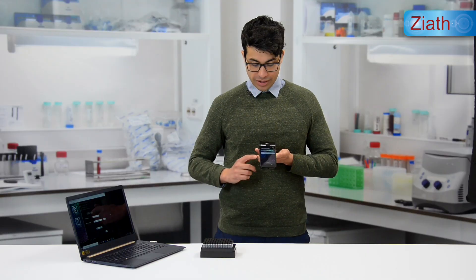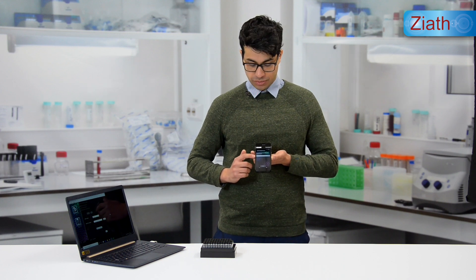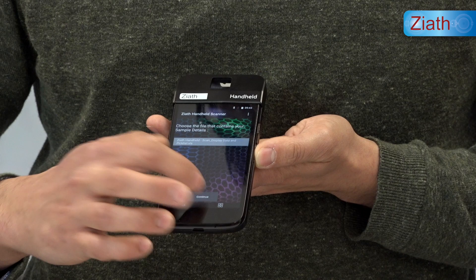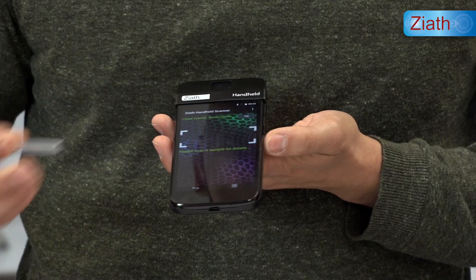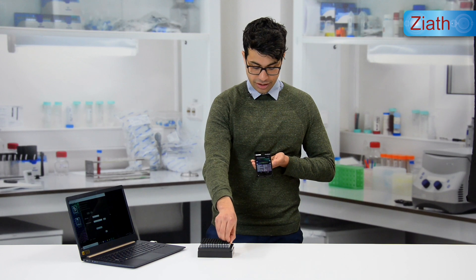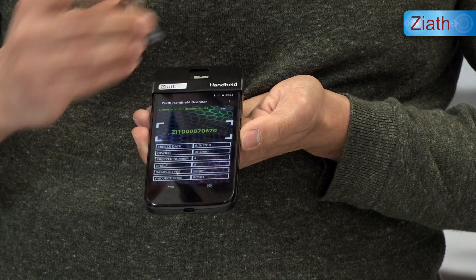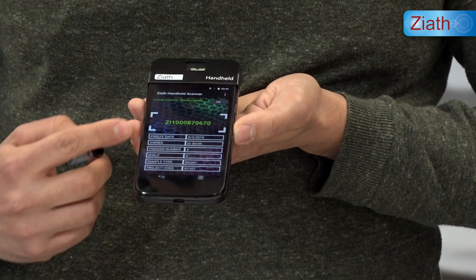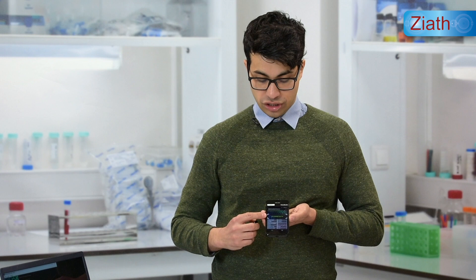The Excel file placed onto the handheld can be seen on screen here. We can place multiple Excel files onto the handheld, which will be displayed in a list. If I click continue on the file, we can now scan any barcode that was contained in the Excel file. Scanning a barcode shows all the sample information that was displayed within Excel. If I scan another sample, that sample's information will be shown on screen. All this information corresponds to the column headers from Excel and is completely customisable.